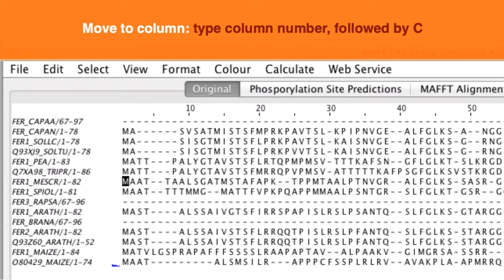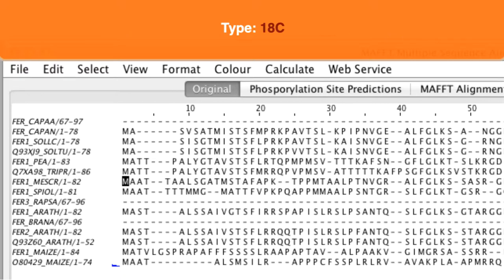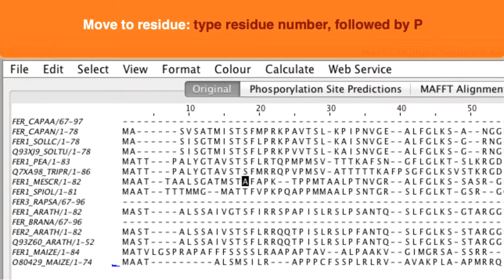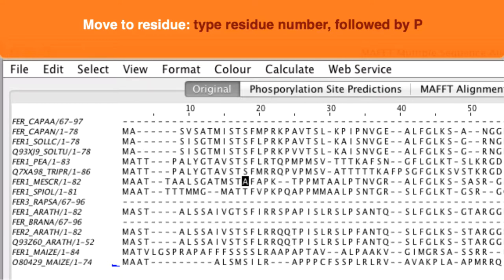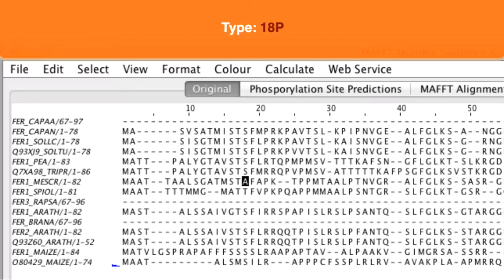To move to a column of interest you type the number of the column followed by C. So to move to column 18 you type 18C. To move to a specific residue in the current sequence you type the residue number followed by P. So to move to residue 18 you type 18P.